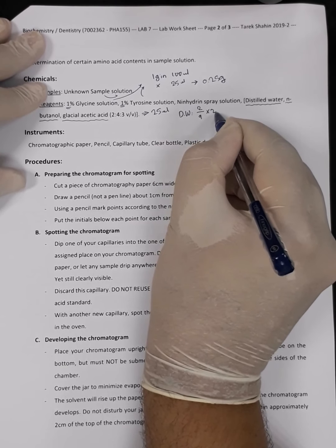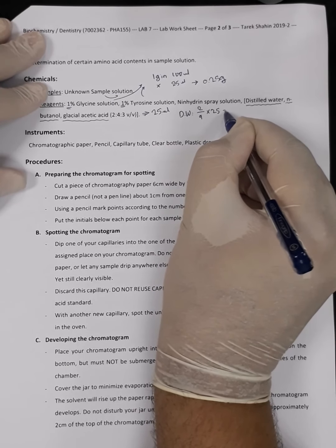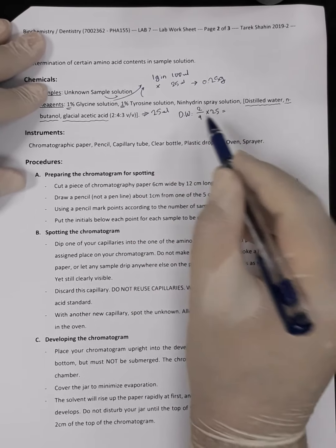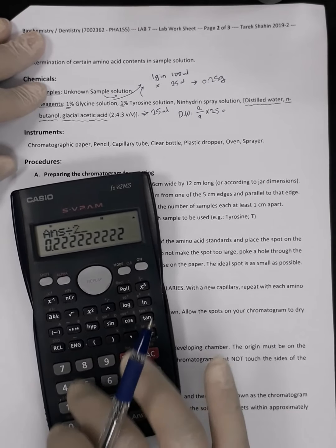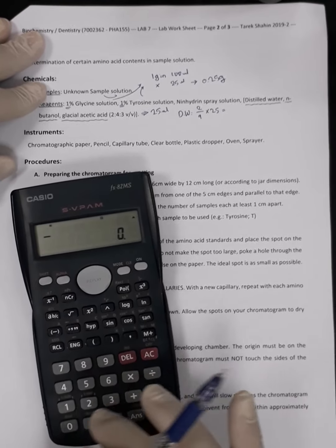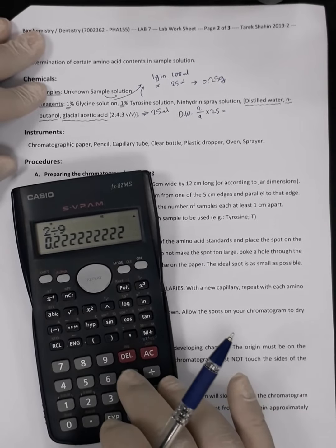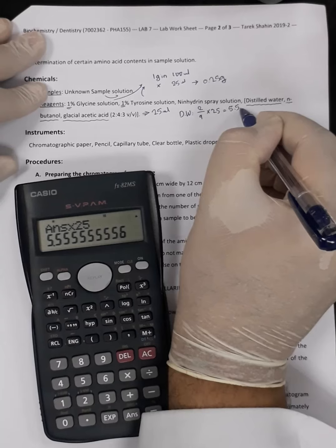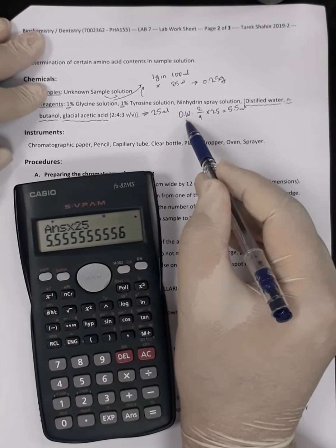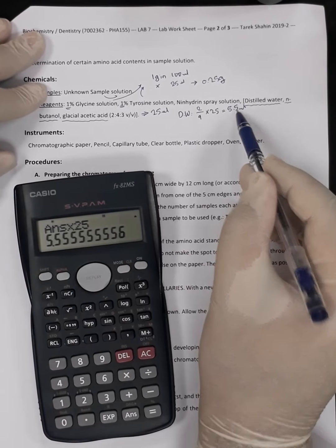Then we multiply it by the total volume of the solution we want to prepare, which is 25 ml. So we do it by the calculator: 2 divided by 9, multiplied by 25. So it is 5.5 ml. So the volume of water I'm going to use is 5.5 ml.